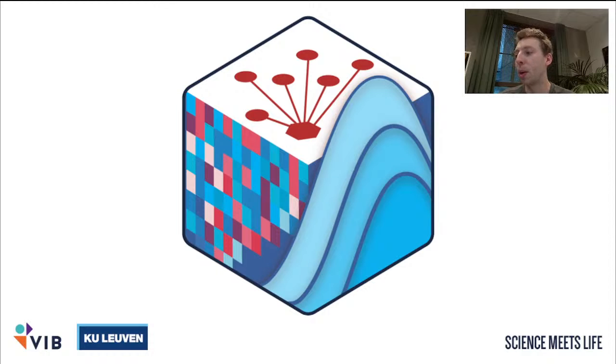Someone is asking why, if you generate a UMAP using pycisTopic and Scanpy, both on single cell ATAC-seq data, the plots are different. I would submit a GitHub discussion for this where you can show the code you're actually using to generate the plot. The code that pycisTopic and Scanpy use to generate the UMAP is also slightly different. But if they are very different, I would use an open discussion.